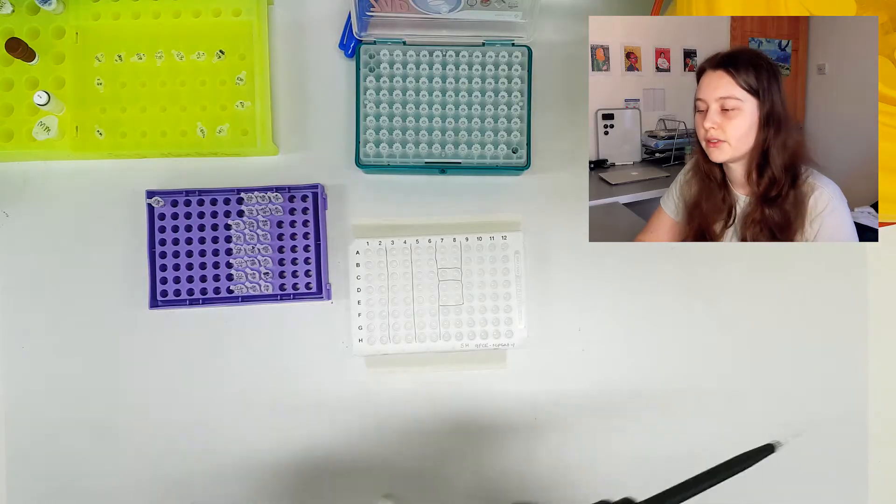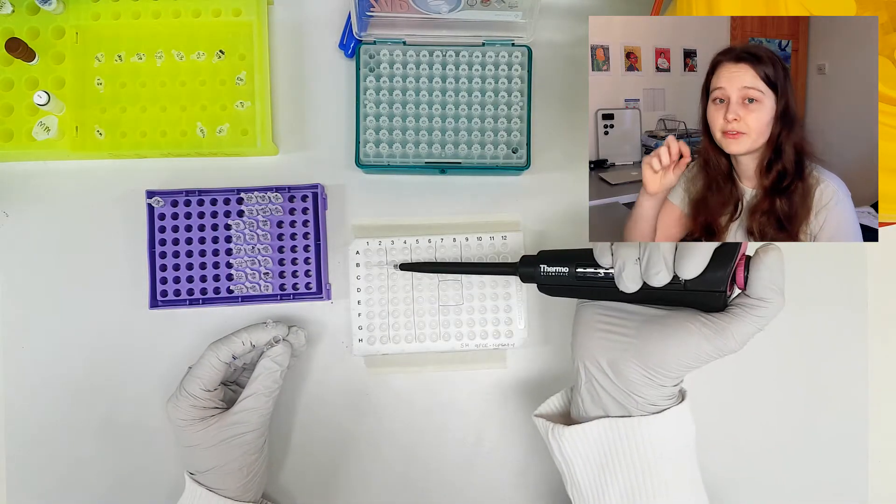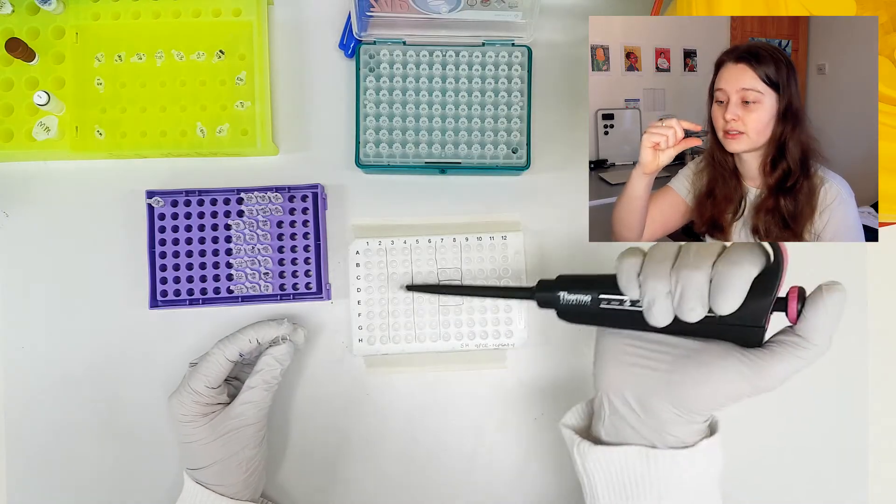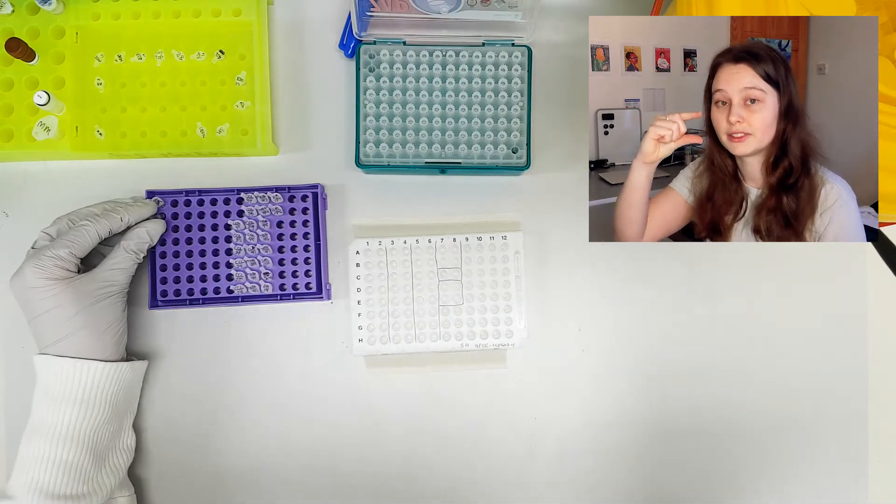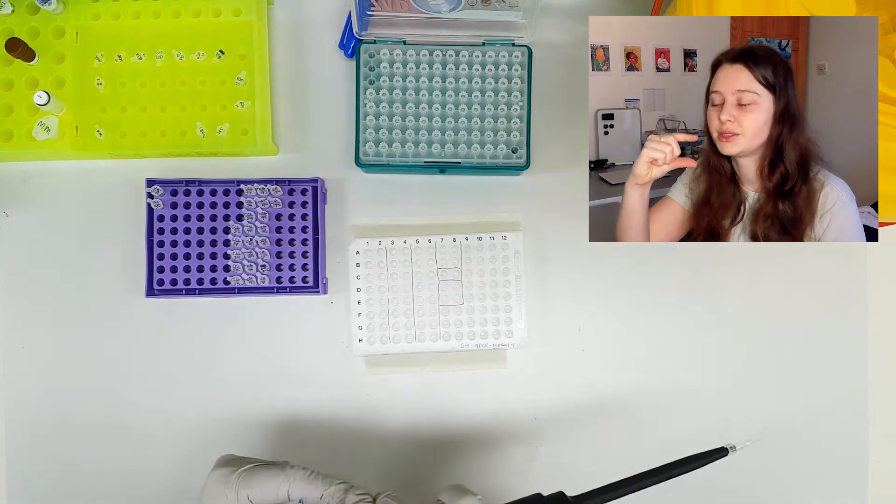So there's a few different ways I've got of making sure what I'm putting where. So the change in volume from 6 microliters of master mix to the additional 3 microliters-ish of sample that's going into these wells is hard to visually distinguish.